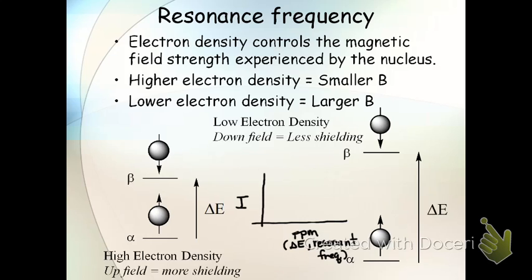And remember, we put 0 here, and then we put larger energies over here. I did 15 before, but you don't see that as often, but 10's pretty common on this end. So we have more shielding up here.